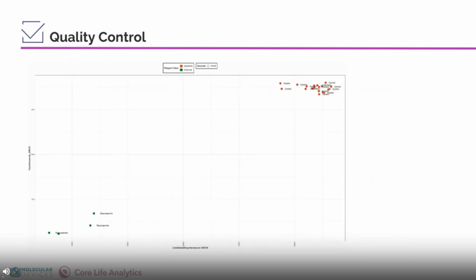And so to elaborate on this a little bit further, quality control is important because it makes absolutely no sense to do high content screening, especially when you're at the assay development stage, and if it takes you many months or even years to analyze your data only to find out at the end that your controls are not working as they should, for example, then it's a bit too late, because already a vast amount of time and resources have been spent.